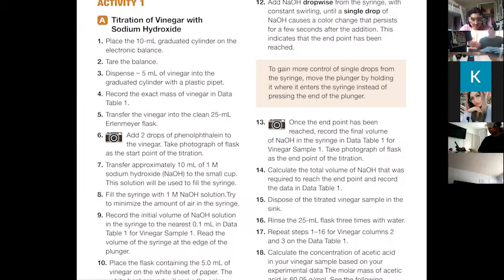Okay, so 5.38 this time. All right, let's go back up to 10 again. Oh, what if we forgot something? What have we forgotten? Before we start, what do we need to? Forgot the indicator.